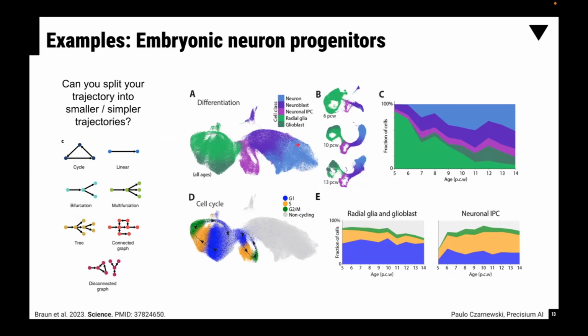Yes. I think it can also be really helpful, when you have time points, to define the end points and starting points of your trajectories, right? Where you have more of the early time points versus more of the late time points. Exactly. As you can see here, some of the most early progenitors are much more abundant compared to the mature ones. So you can see, okay, this is definitely a mature state, especially for this system where you kind of know that. Any more questions? Thank you.